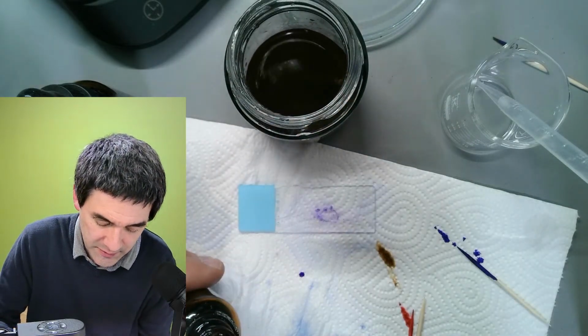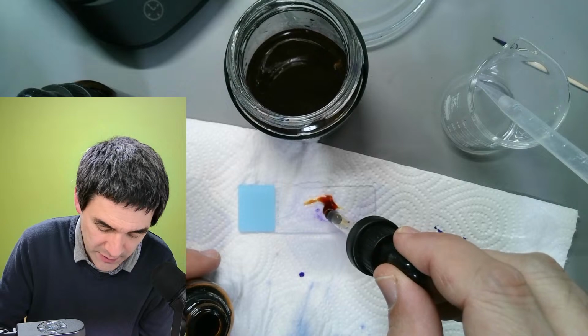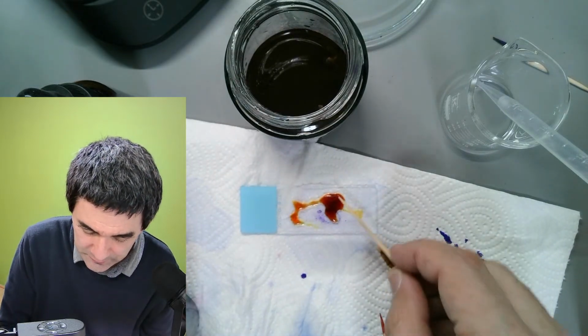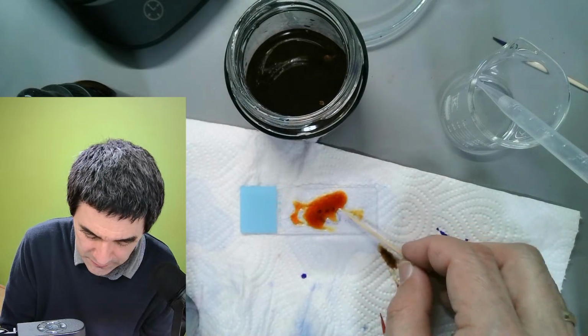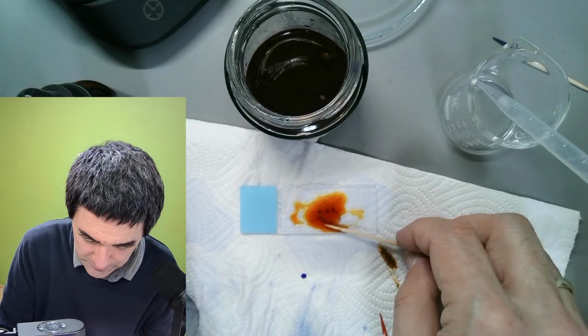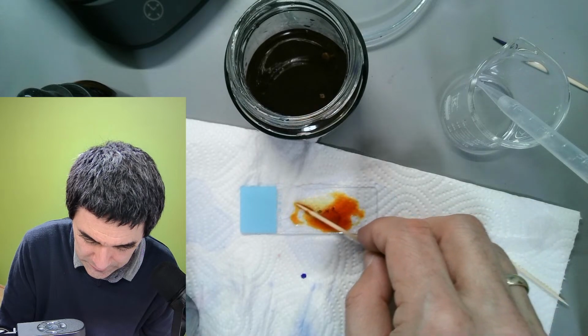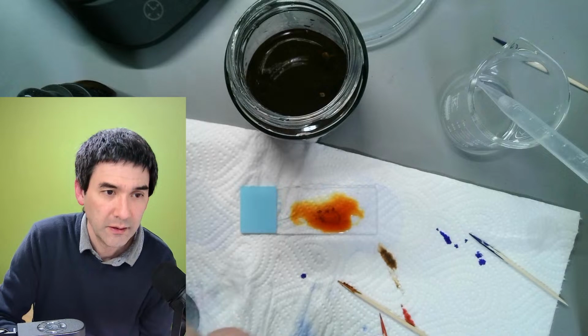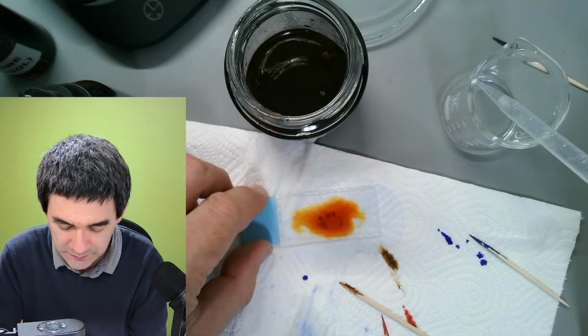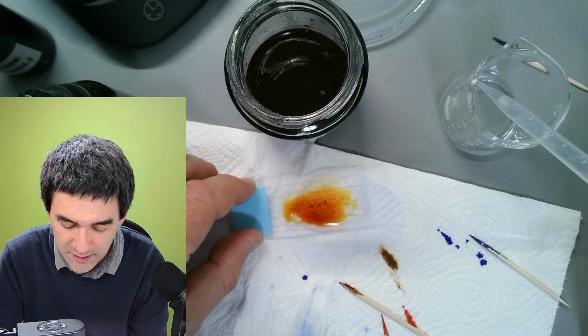Okay. So some iodine for 1 minute. Okay. So let's see how this works.